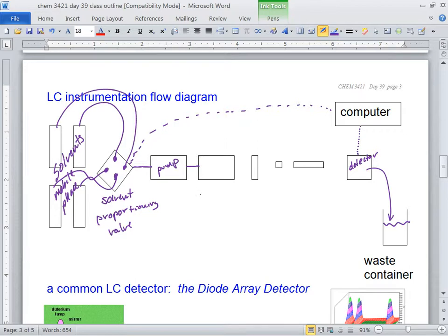And then what's kind of odd, what would you call this? Maybe a pressure dampener. And I think this is just evolution, because before, without this, they'd have their time and their signal, their chromatograms, and it might look kind of like this.